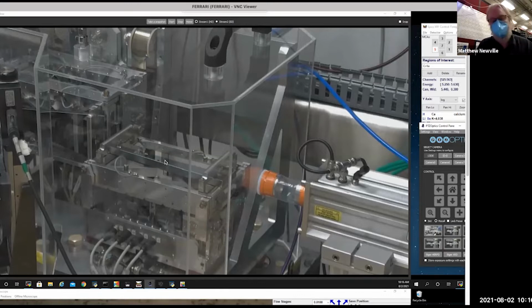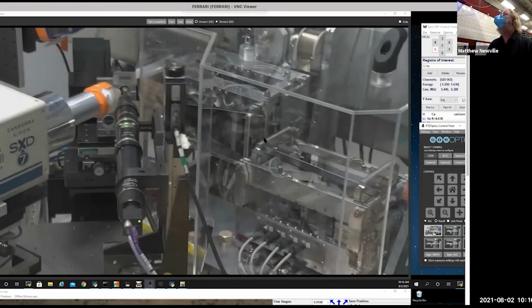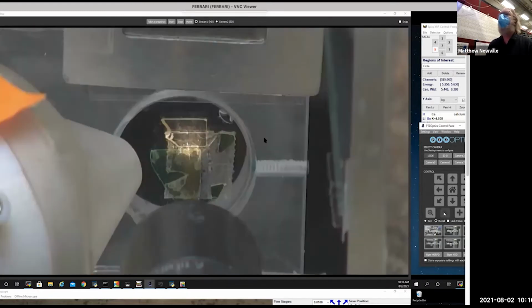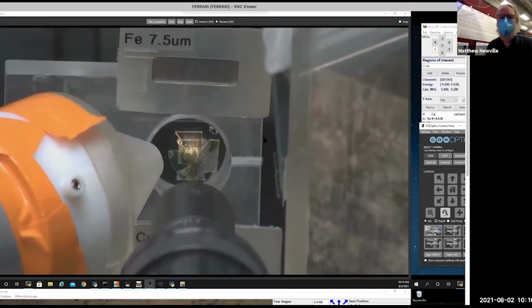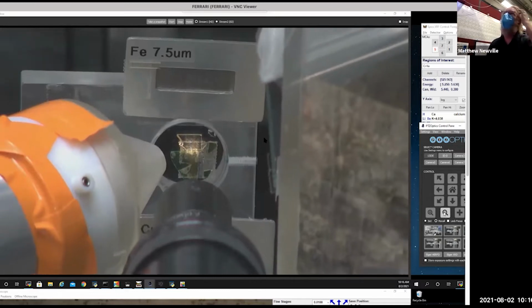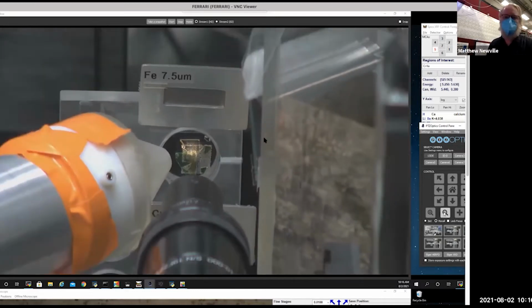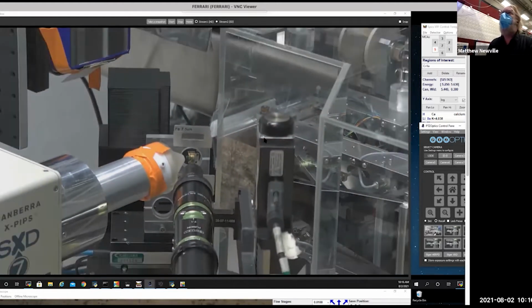That one flat mirror focuses in one direction, the vertical, and then there's another one just downstream of it that focuses in the horizontal. So that way we get a beam at our sample position here, I can zoom out a little bit, that is focused to a couple of square microns. Actually, I think I have it to about 5 microns right now. I'll talk about why I defocused it a little bit from our optimal position in a second. So there's where our sample sits.